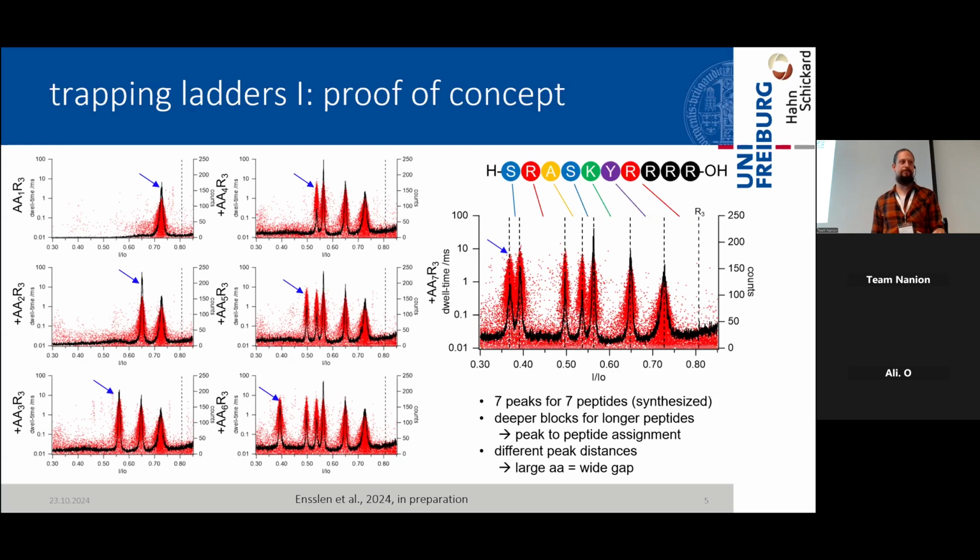So I'm wondering, if you use sort of HEK cells or some non-cancer cell line, whether you would see the same thing. That's a very good idea. So we need to do that. What I've shown here with the SynchroPatch study was just the very first shot of experiments, so it's very preliminary, but in the end, indeed, this is what we need to do next. So now compare different cell lines and see whether we can find differences there. Yeah. More work for Tom at SynchroPatch in Freiburg then? That would be cool.